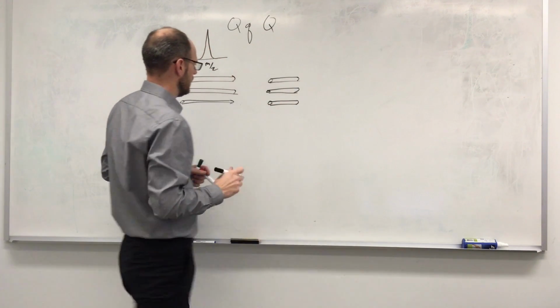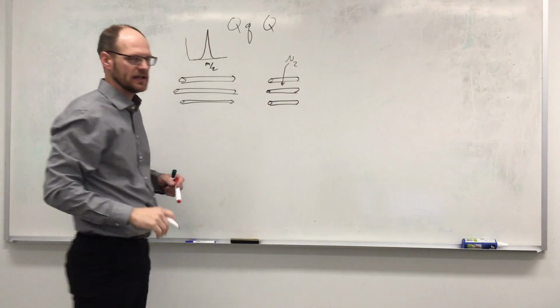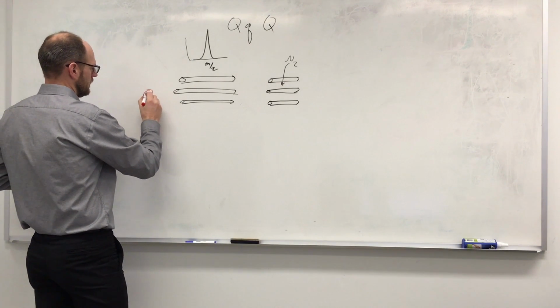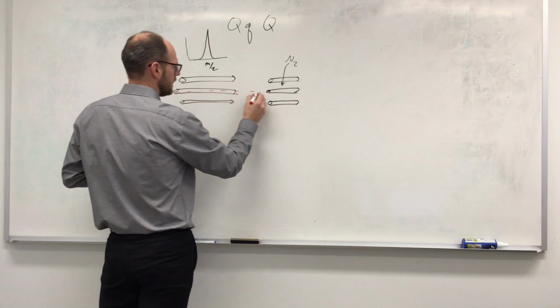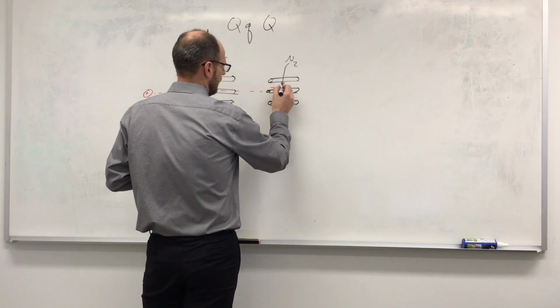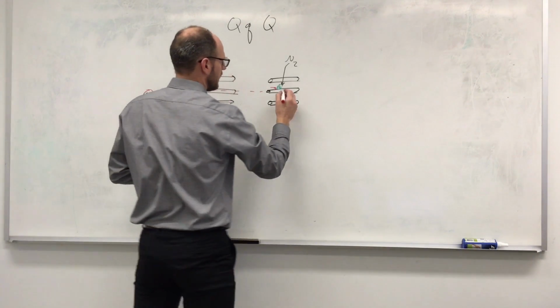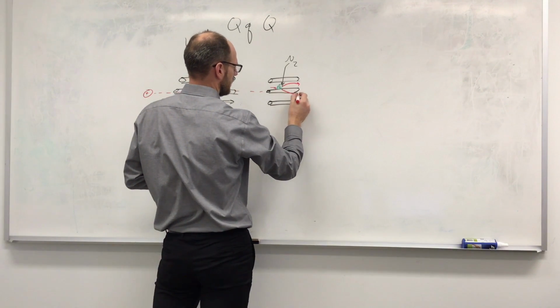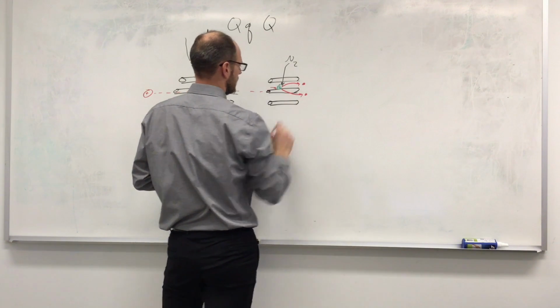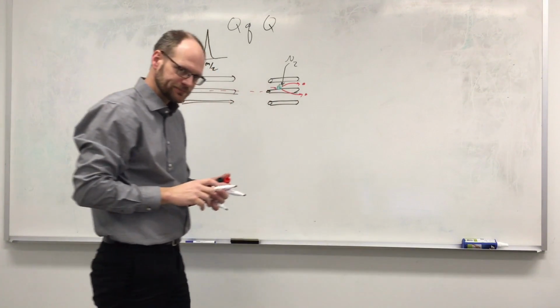In this particular quad, you leak in a small amount of nitrogen, and then the masses that are allowed through collide with nitrogen gas, and when they do, you get a spray of smaller ions, and these are all different mass to charge ratios. Those come out the back of the instrument.